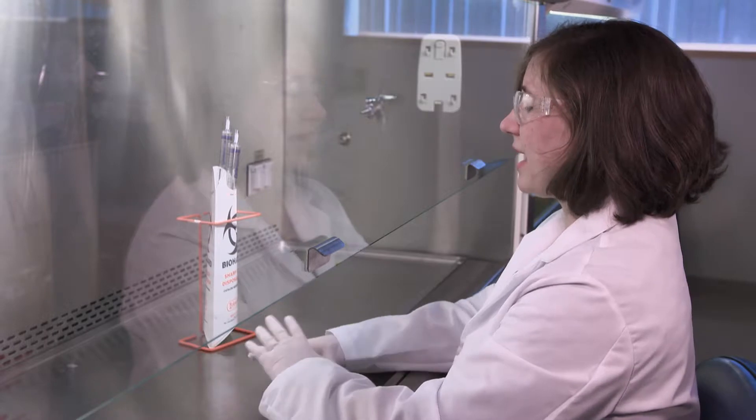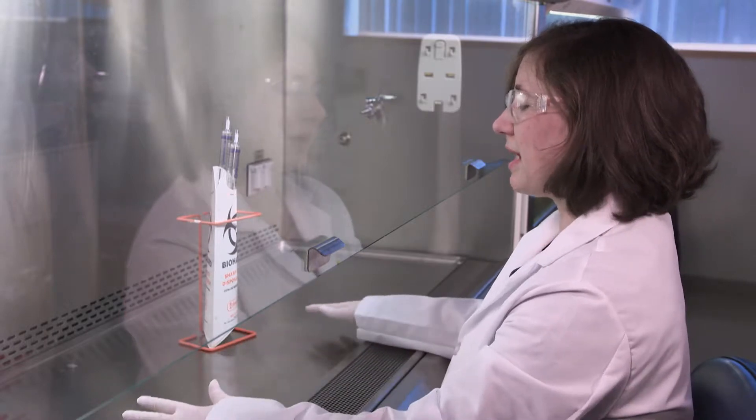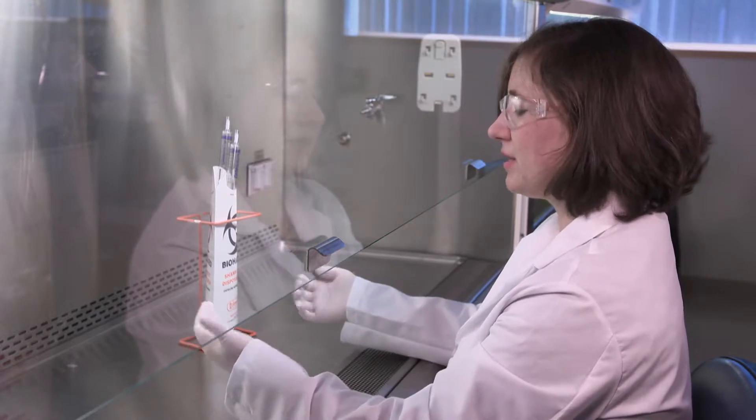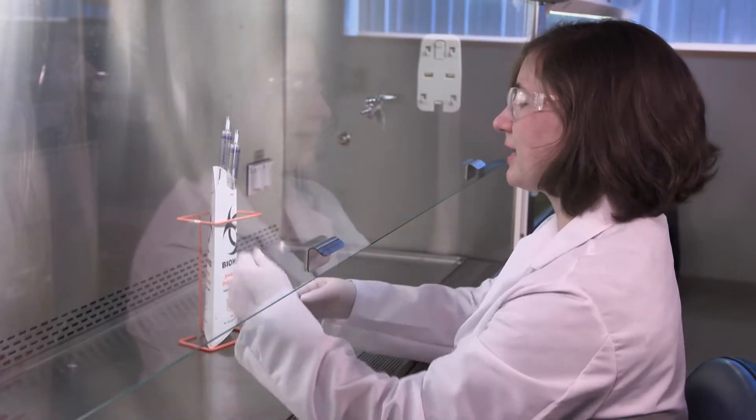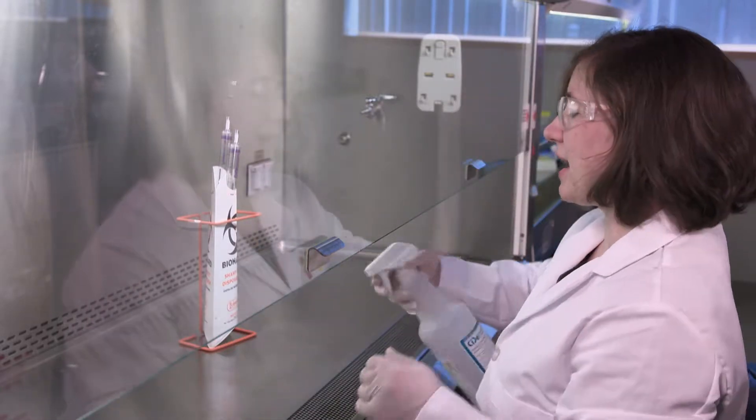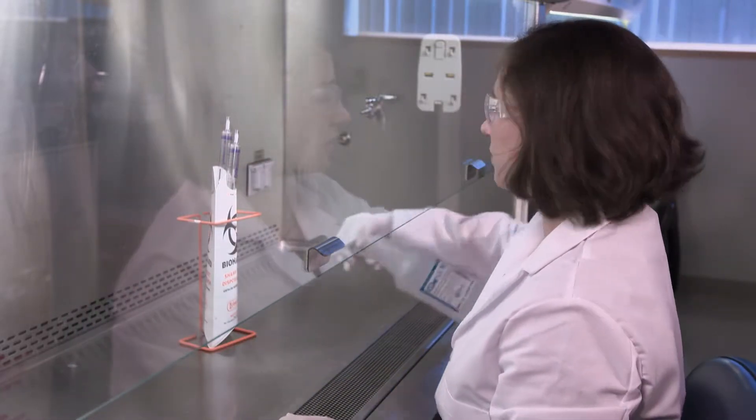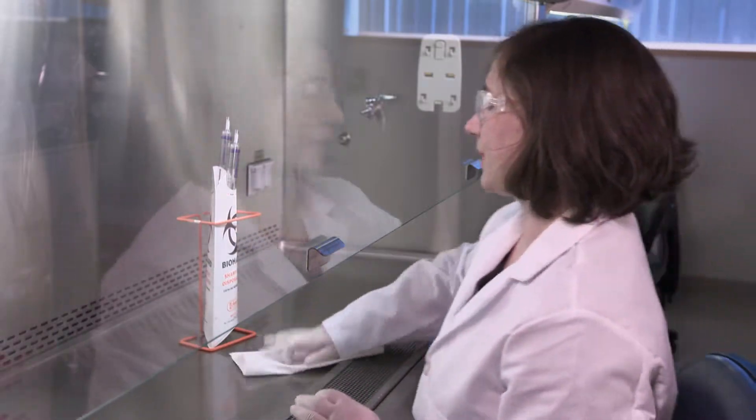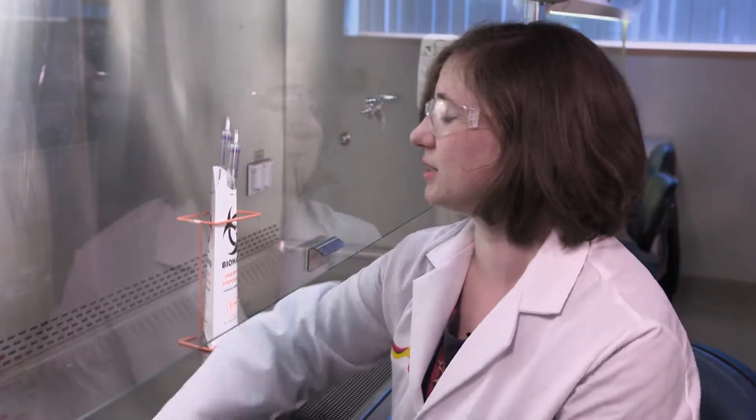Proper aseptic technique involves having a clean biosafety cabinet and proper PPE donned before entering the biosafety cabinet, which includes gloves, lab jacket, and glasses. Then, upon entering the biosafety cabinet, you will clean with IPA solution and wipe the surface until dry.